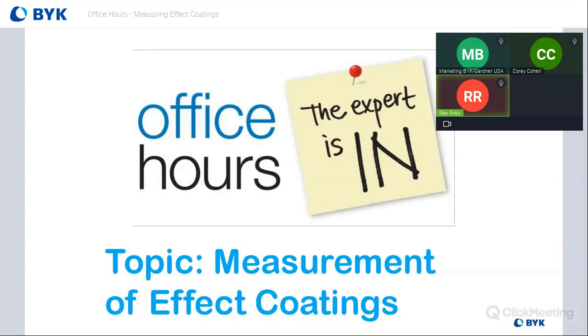If you're trying to characterize effect pigment, the most important information is at the 15 and minus 15, maybe a little bit at 25. If you're looking at more of the absorption pigments or the underlying color, then 45 is going to be more valuable in that respect. 75 and 110 will give you more information about process variability.